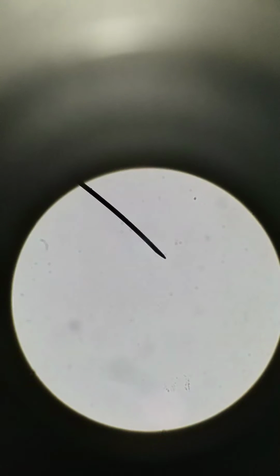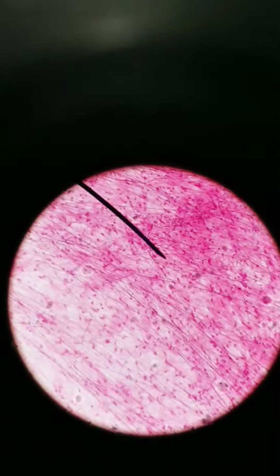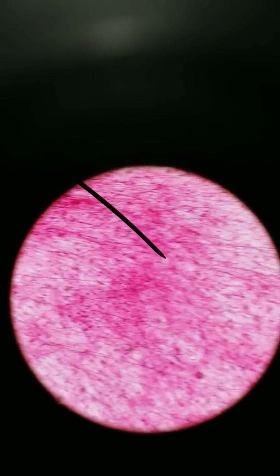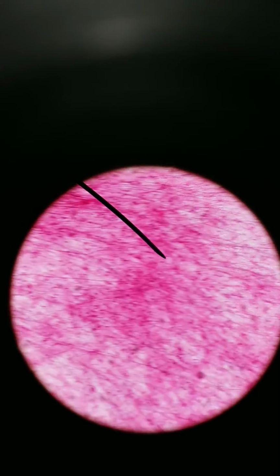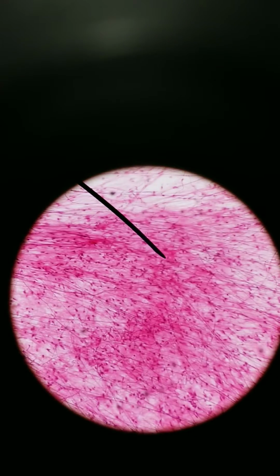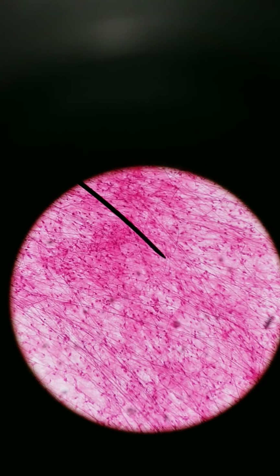We are switching to another loose connective tissue proper. This tissue, we're at 400, let me go back to 100. This tissue is called areolar connective tissue. And areolar connective tissue is like your do-everything connective tissue. It's a little bit stretchy and flexible. It's a little bit supportive, a little bit cushiony, not too rigid, but not too soft. It does everything kind of well.